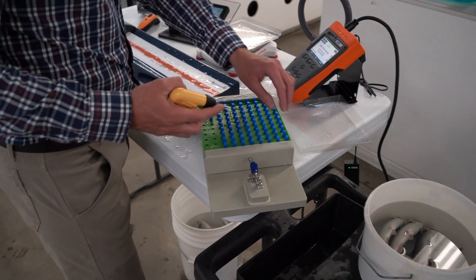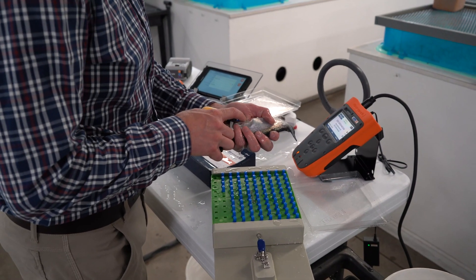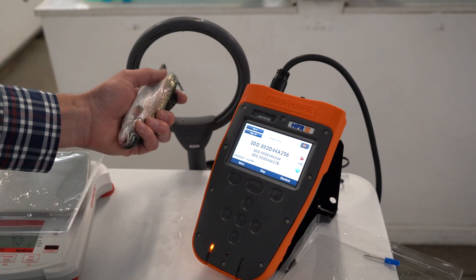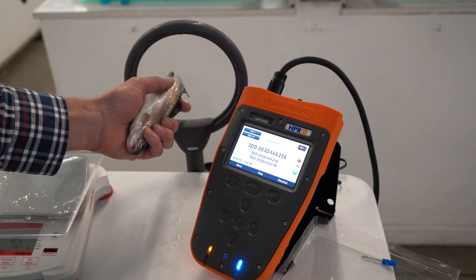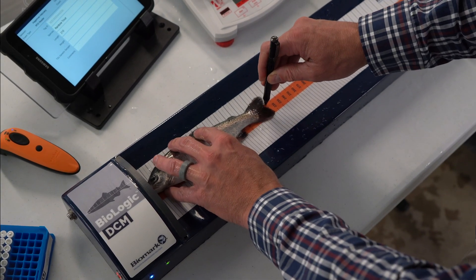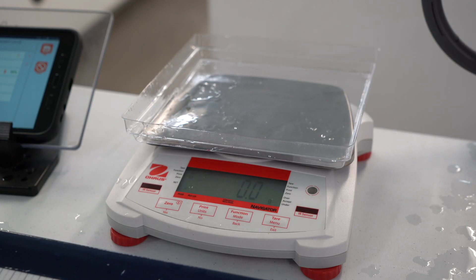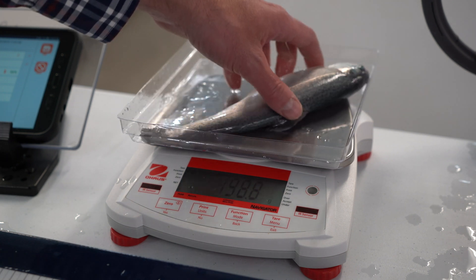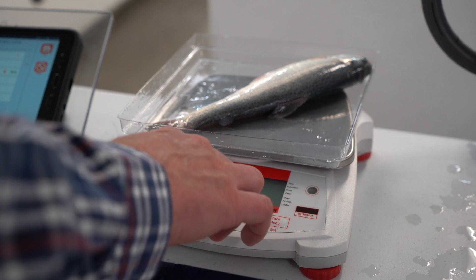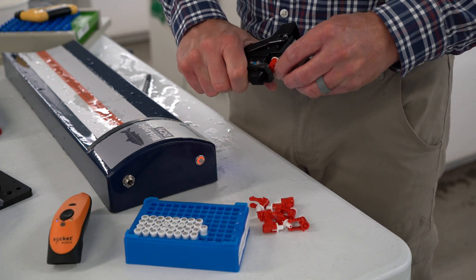Today we'll be PIT-tagging rainbow trout with our pre-loaded tray system. Once the fish is PIT-tagged, we'll scan it with the HPR Plus Reader. Take a length on our fish measuring board, record an individual weight, and take a genetic sample with our tissue sampling unit, or TSU.